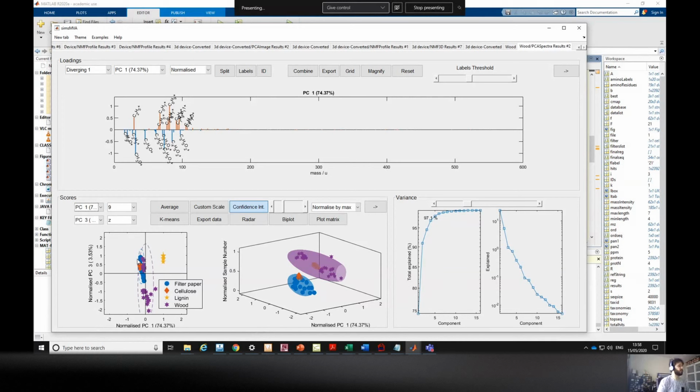And I remember last week it was quite difficult to say these things because the samples were really well grouped and it was very obvious that they were different. So now you can see sometimes, especially I know those of you dealing with biological samples, it will never group as well as standard acids. So wood is one example, but there are other cases that are even worse. So you get kind of an overlap between groups. And when you do PCA and then scatter plots between principal components, it may help you to see what's going on.